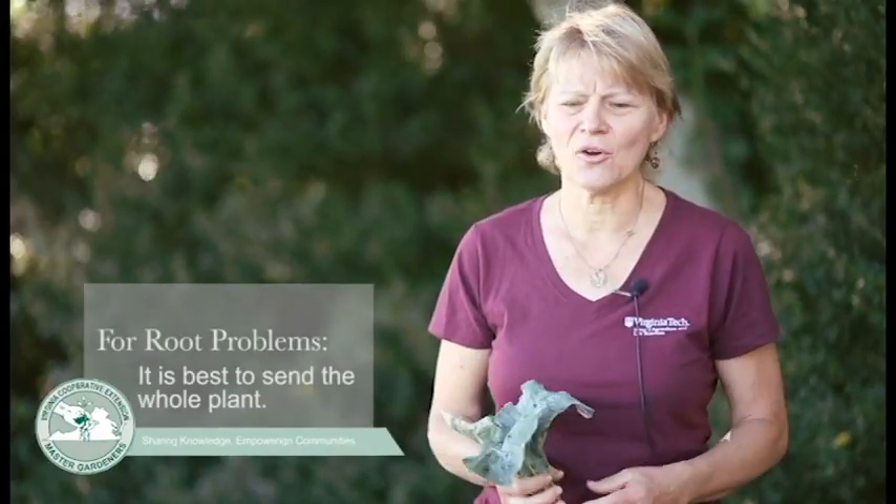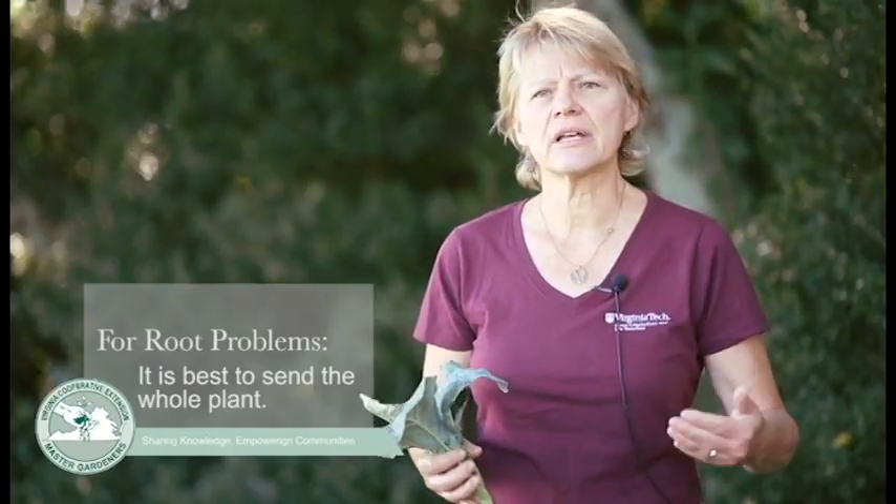In vegetable gardens, the nematode problem you often see is root-knot nematode. In that case, we'll be able to see the galls on the roots, but only if you send the roots — so again, a whole plant is best. If we're going to extract nematodes from the soil, we need at least a pint of soil taken from the root zone of the plant, and then we can process that for plant parasitic nematodes.